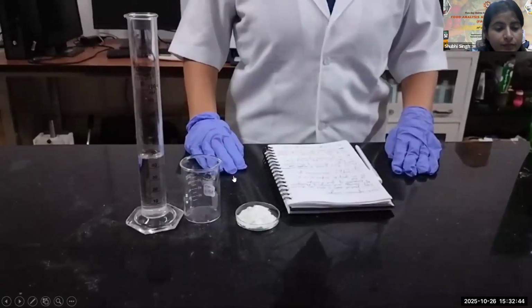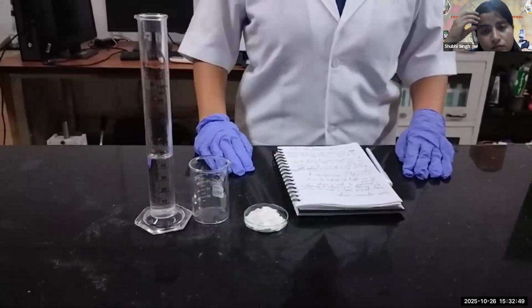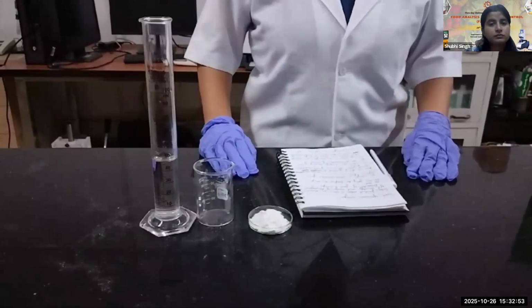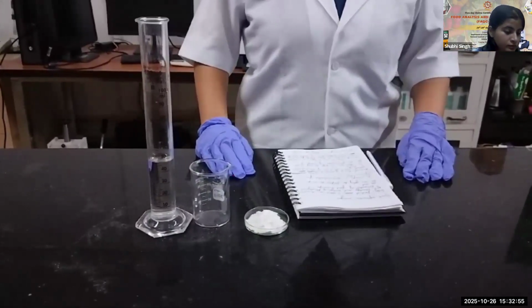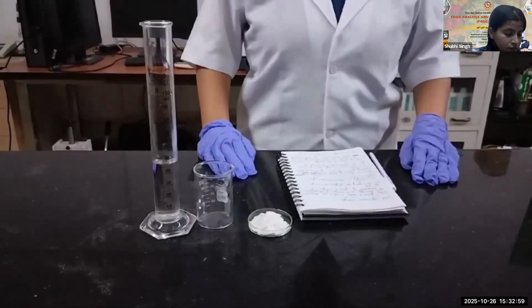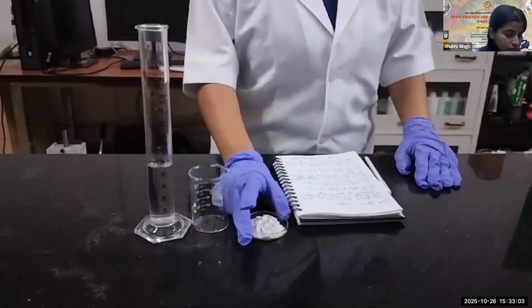Good afternoon, everyone. Today's practical session is about the demonstration of rheology and analysis of rheological parameters of food sample. For that, we are going to prepare the sample. The sample is starch extracted from tapioca root.